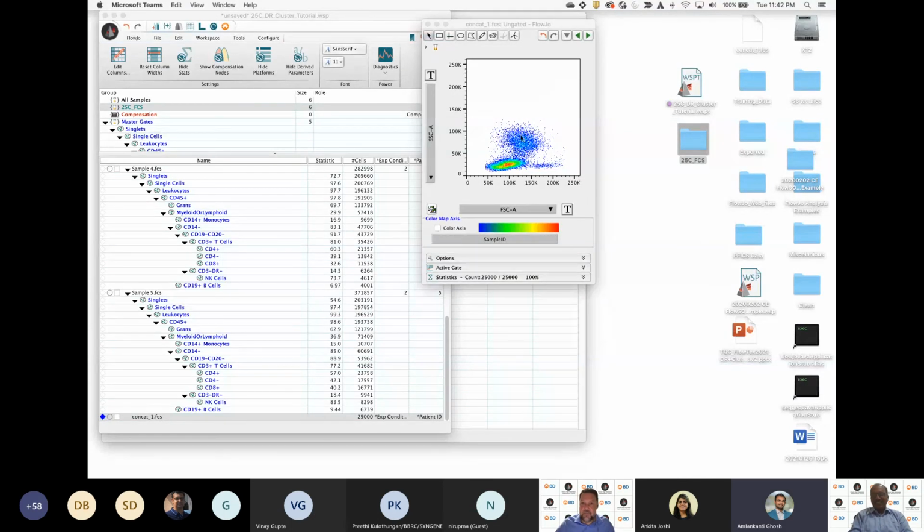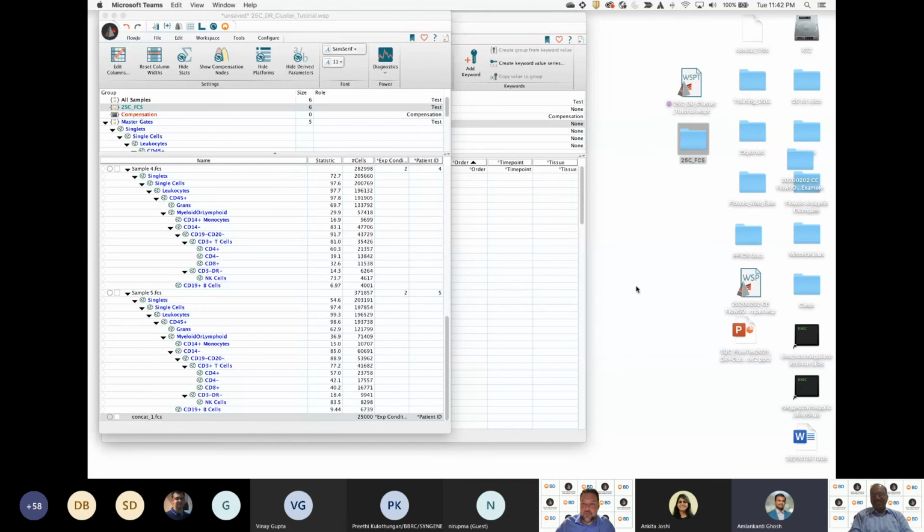That was a fantastic session, Tim, and some really cool stuff was about to happen, but just because of the time crunch, we couldn't do it. So I would request that in the next session we can have a small, half-hour session where you show us some of these things, like Hyperfinder, what you were about to show.